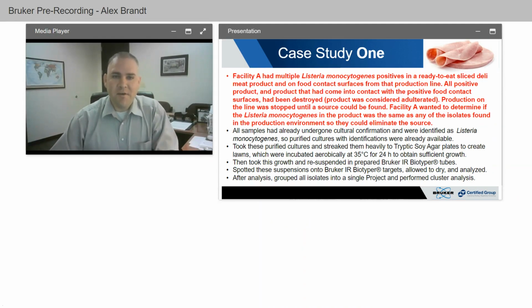All right, so here's case study number 1. We'll just call it Facility A. They had multiple Listeria monocytogenes positives in a ready-to-eat sliced deli meat product and on food contact surfaces from that production line.